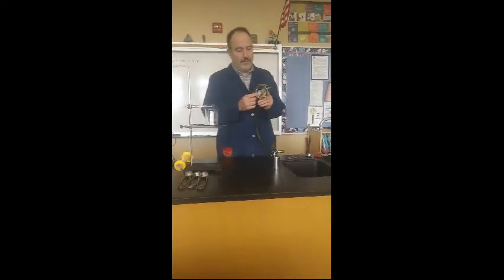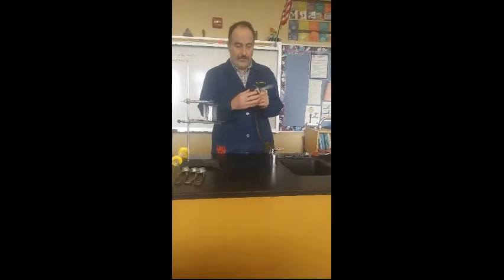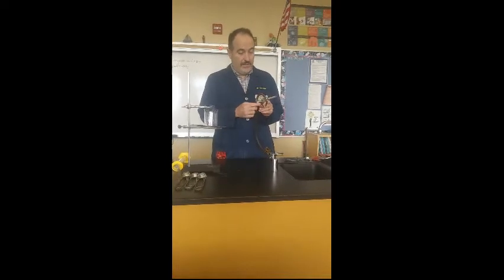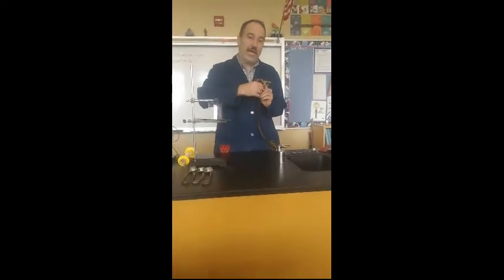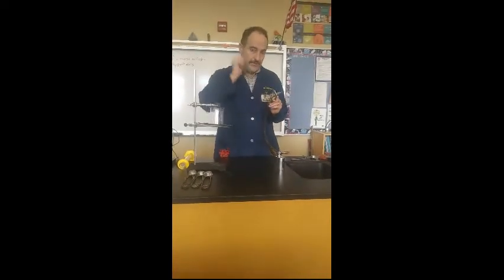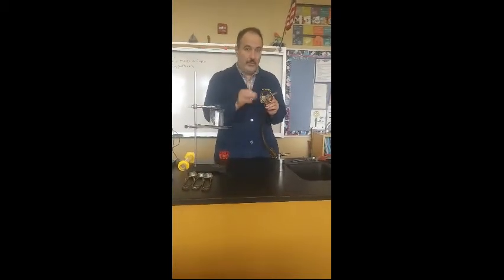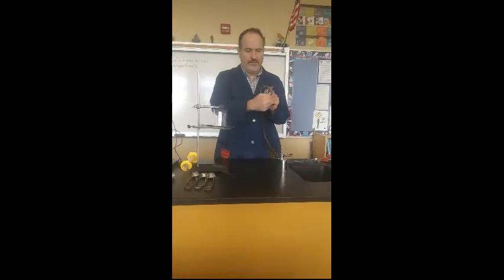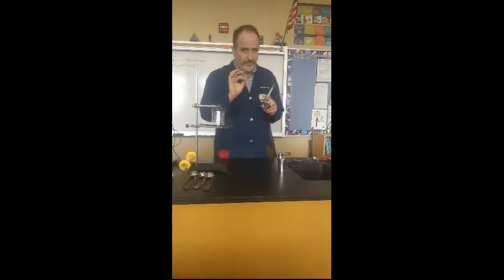So then you want to make sure about the gas. This is the next thing. You want to make sure you have the right amount of gas that's coming into it, okay? And the way you do that is with the gas adjustment valve on the bottom. Now you don't know where this was left by the person before you. So the best way to do it is you go ahead and you tighten it by twisting it like you're turning off a faucet. You tighten it all the way to close it. And then you immediately reopen it by turning it at least about a 3/4 of a complete turn to a complete turn, so somewhere in that area, all right? And that should give you the perfect amount of gas to give you the exact correct amount of height, all right?